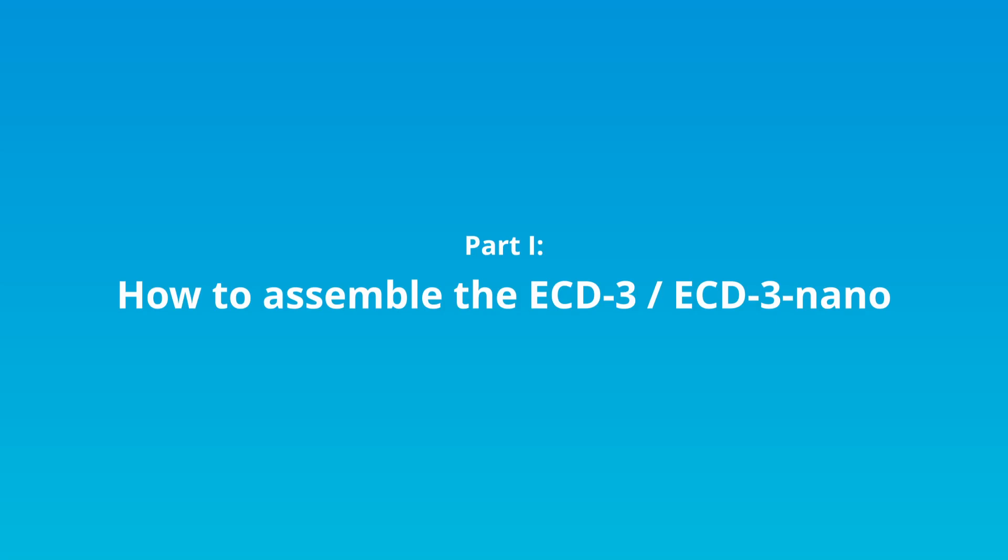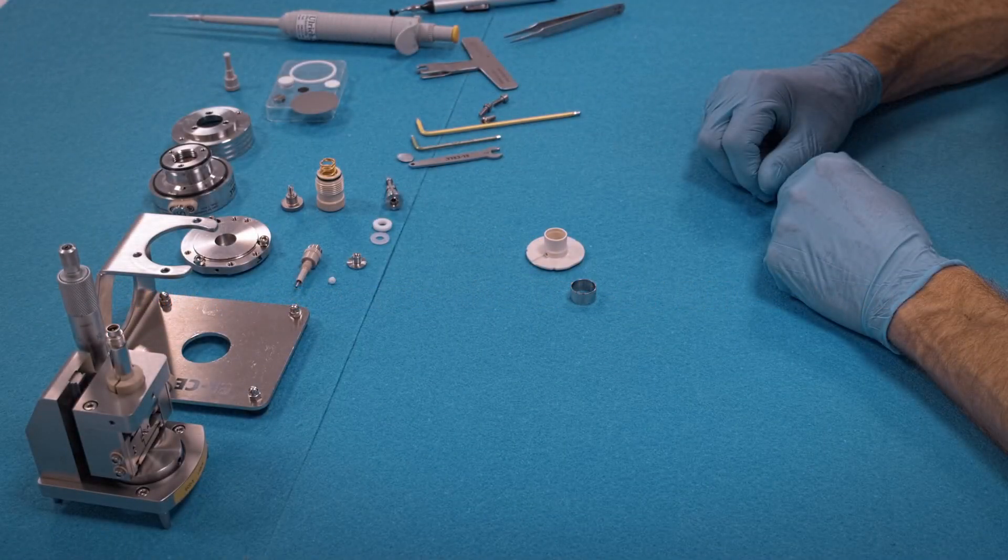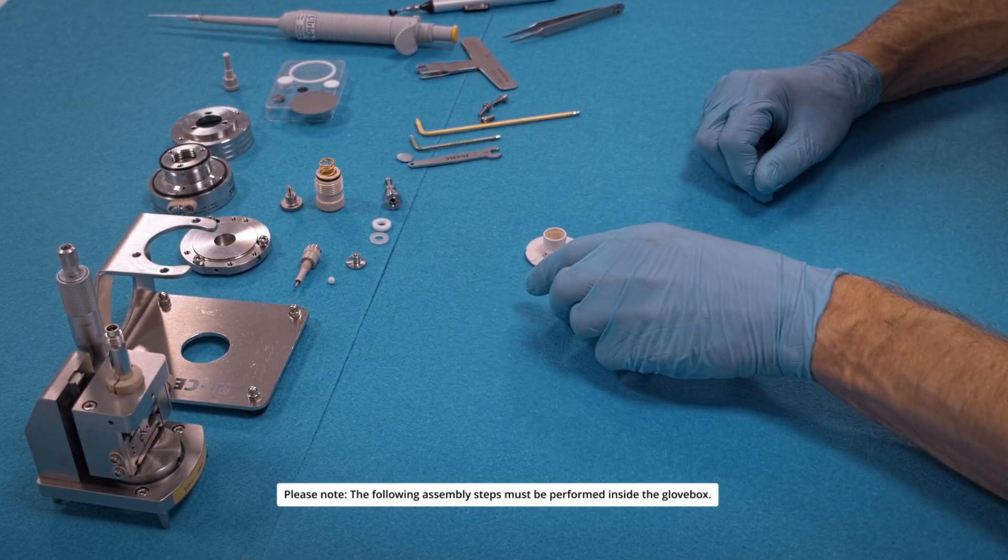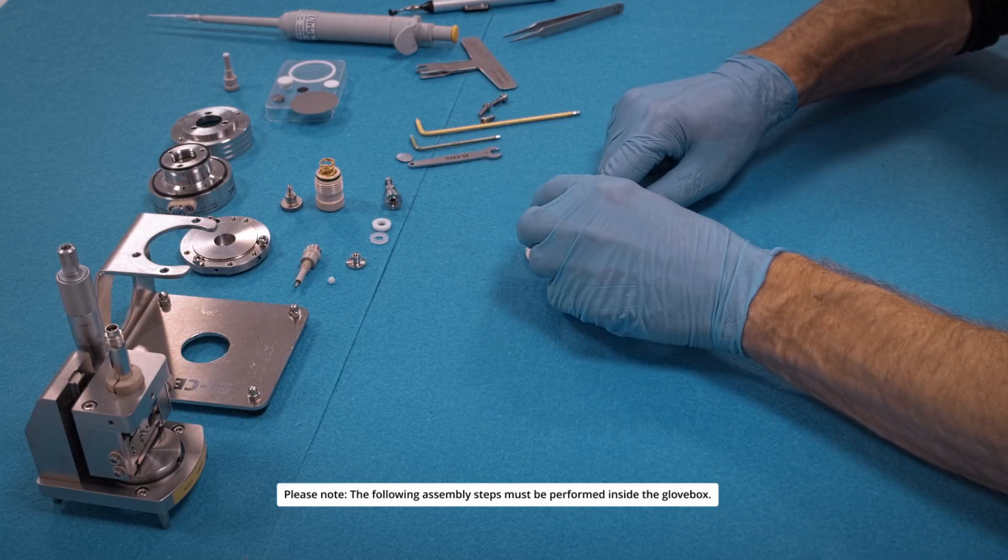This video explains assembly and disassembly of the ECD3 dilatometer. Part 1 is about assembly. First, we have to assemble the frit flange.